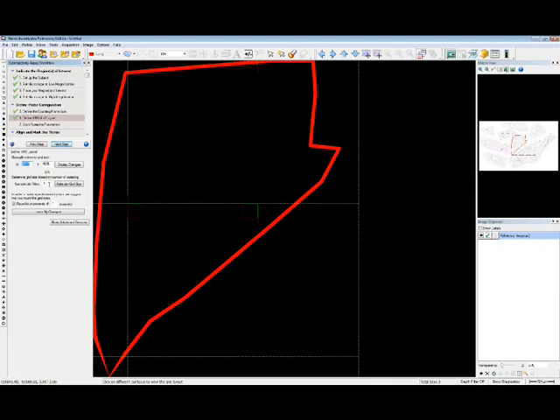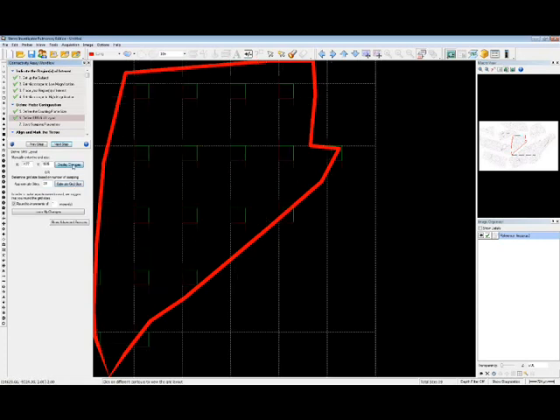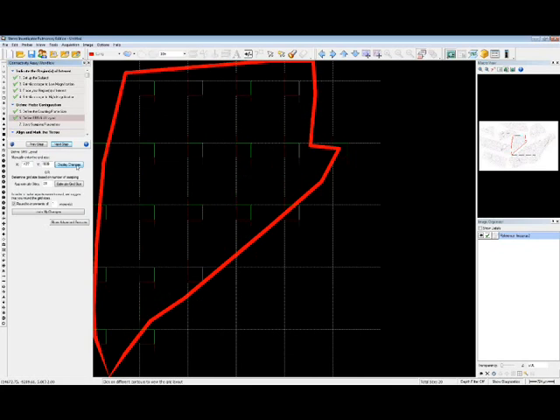This is where we can set up our grid. What the grid tells us is we can go in and say we want to see an approximate number of sites. This way we can see roughly what the distribution is going to be. What that implies is that we're trying to do systematic random sampling. The systematic part is the size of our dissector and the spacing between the dissectors. The random part is the actual placement of the dissectors on the screen. So every time I click on display, the location of the grids on the screen changes.